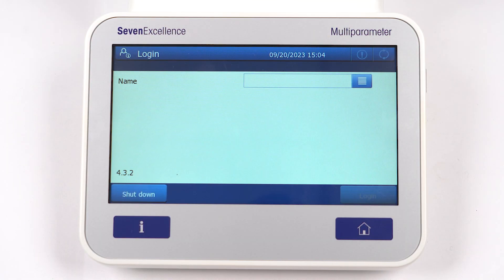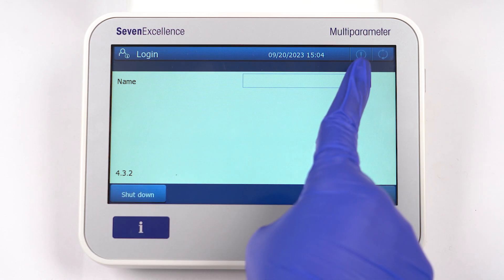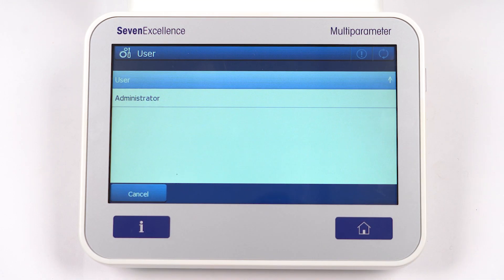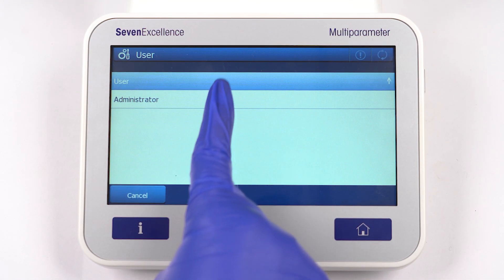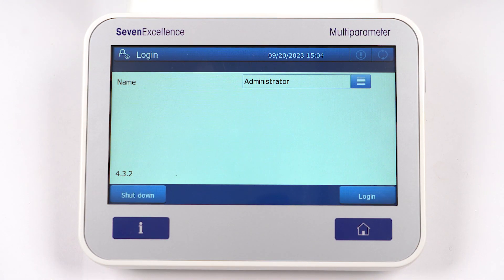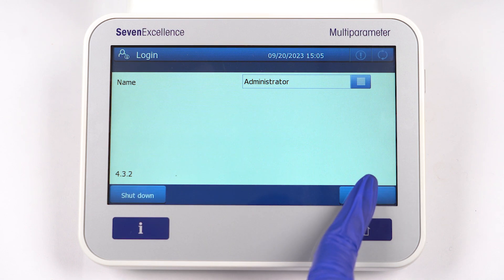To start with, let's login to the 7-Excellence. Simply tap on the icon next to the name field and select administrator. Then tap login.